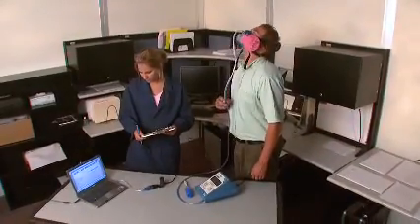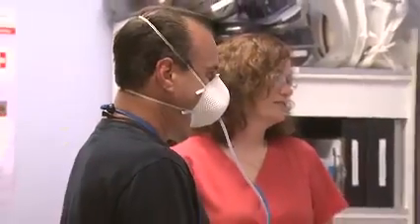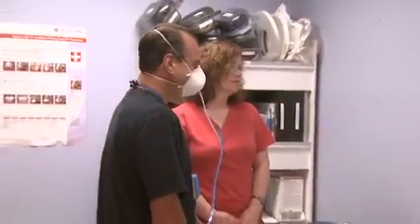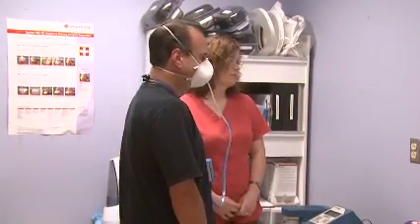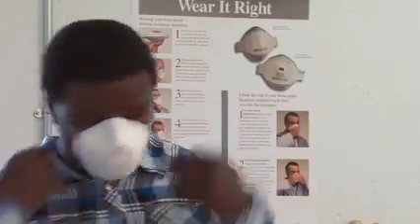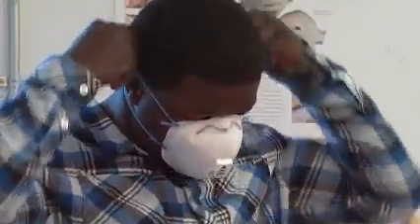You must be fit tested before you use a respirator in the workplace, and you must be retested at least every 12 months to make sure that the respirator you use still fits you. You must be fit tested with the specific make, model, style, and size of respirator that you will be using. Not everyone can get a good fit with one specific respirator. If the respirator fails the fit test, then another make, model, style, or size must be tried until one is found that fits you properly.